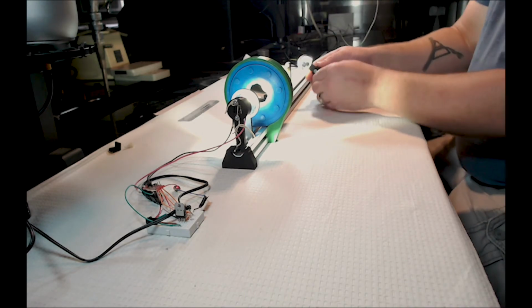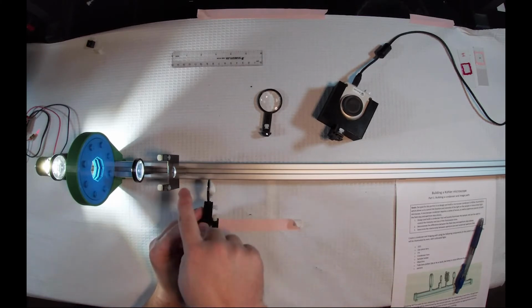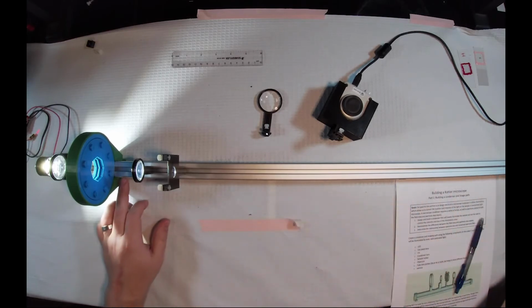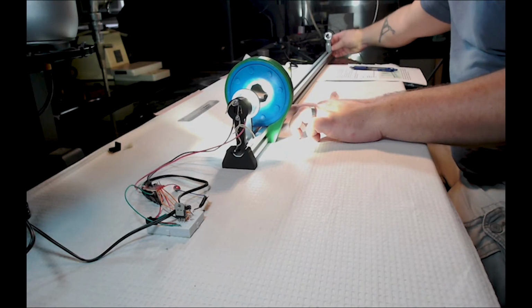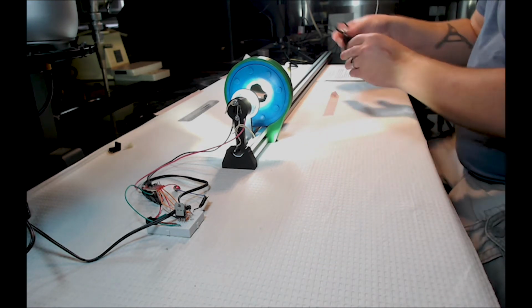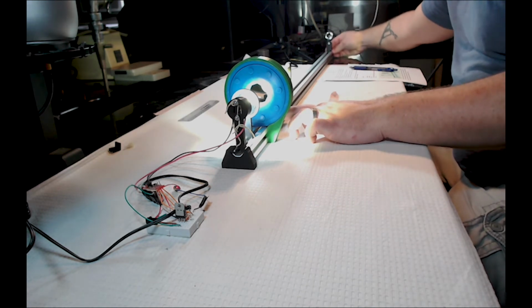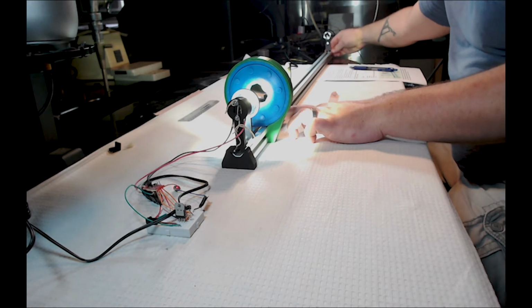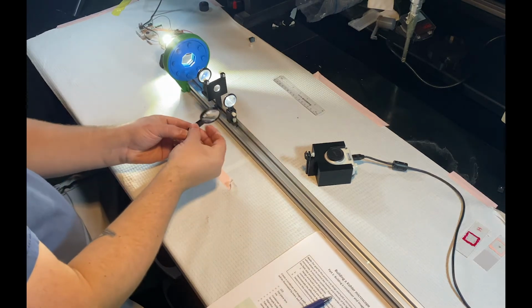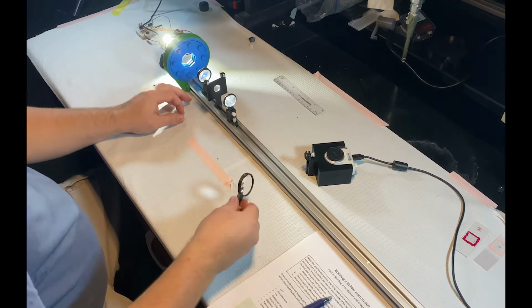We have our objective lens. Again, curved goes to collimated, so we're going to have divergent rays coming off of our sample, and it will be collimated behind it, so make sure to put the curved side back there. That also allows the objective lens to get nice and close to our sample, which is useful for an objective lens that has such a short focal length, in this case 20 millimeters. Now, you should have all of these focal lengths recorded from Lab 2, so go ahead and pull those up. Those will be necessary for later in the lab.